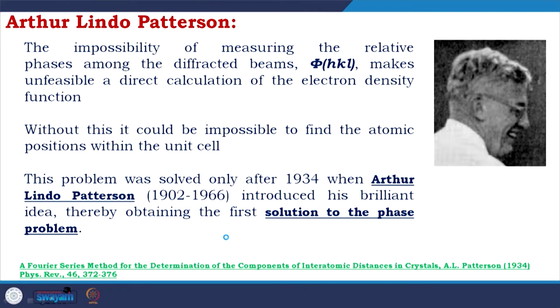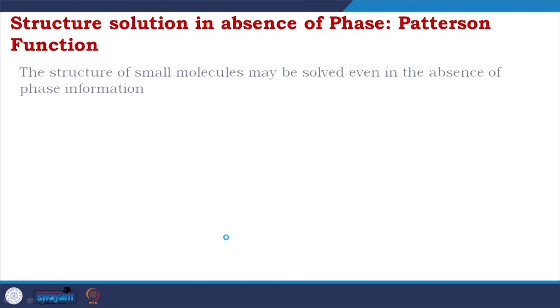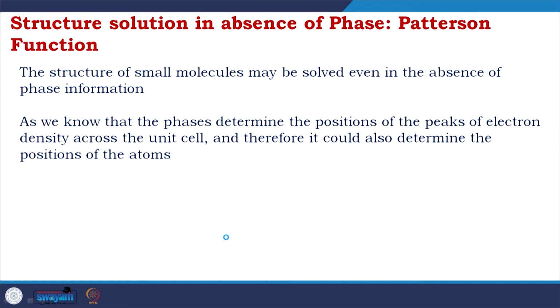We are going to discuss in detail. Structure solution in absence of phase: the Patterson function. The structure of small molecules may be solved even in the absence of phase information. As we know, the phases determine the positions of the peaks of electron density across the unit cell, and therefore, it could also determine the position of the atom, right.